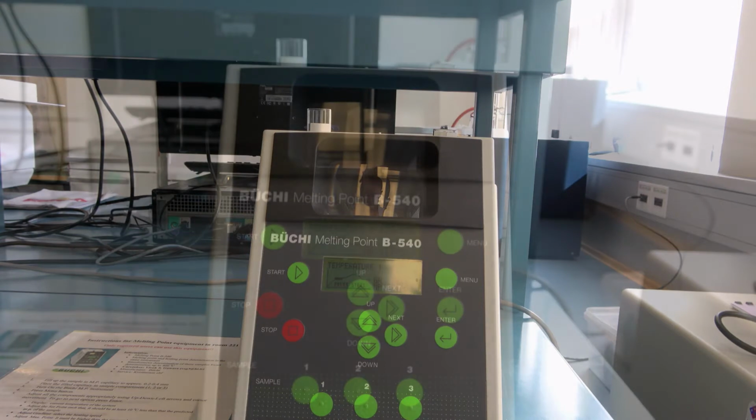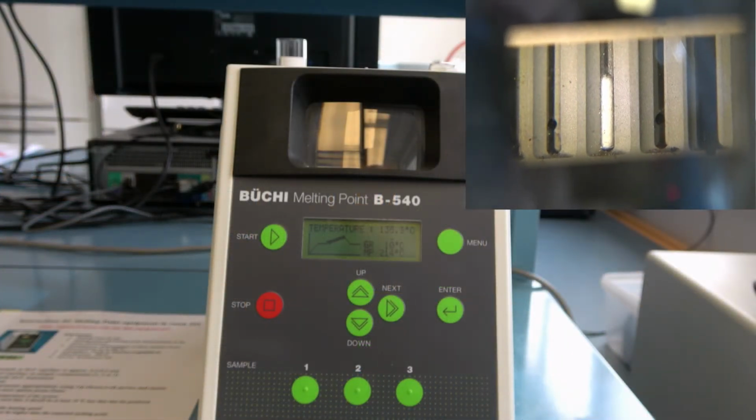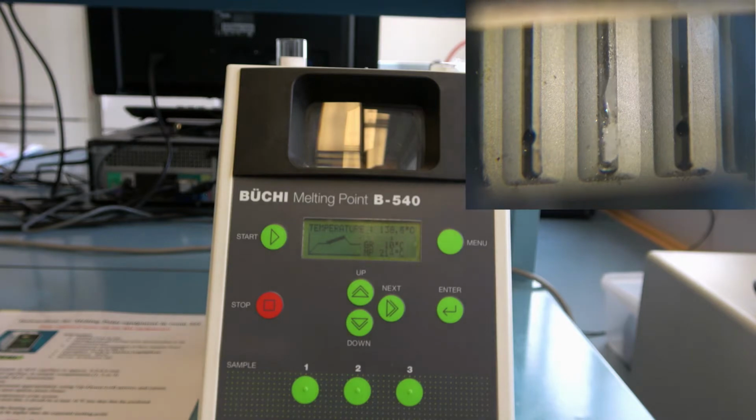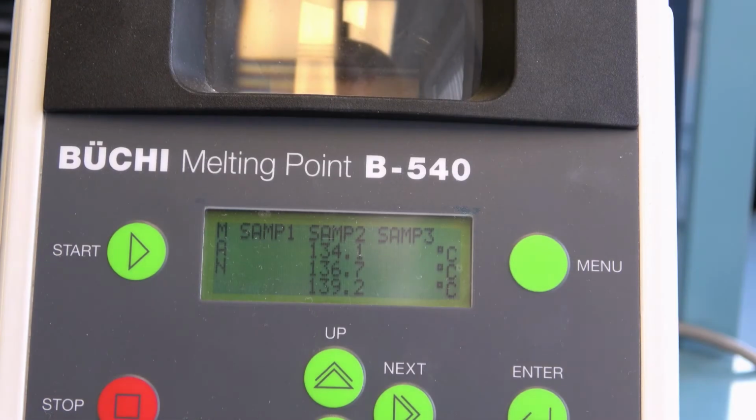When the sample first starts showing signs of melting, the button is pressed. When the sample seems halfway melted, the button is pressed for the second time. Lastly, the button is pressed when the sample is fully melted. When the sample is fully melted, the stop button can be pressed and the temperature gradient can be seen.